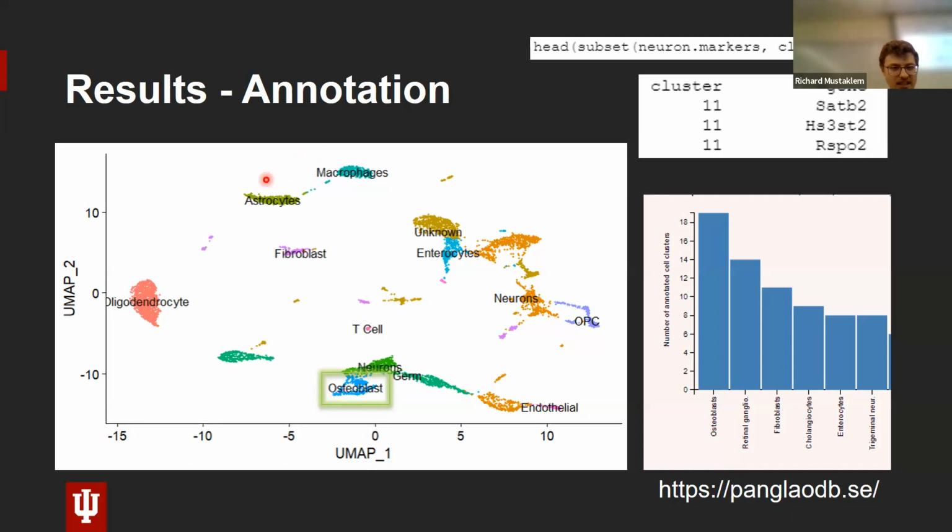So here are the macrophages and astrocytes, right? So just to reiterate, they're so far away from everything, but yet they're so close together. This could be something that you want to investigate, maybe in another data set or something where you have more data. You can look at just astrocytes and macrophages.